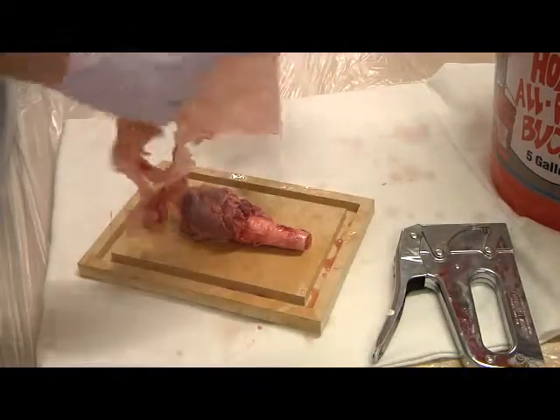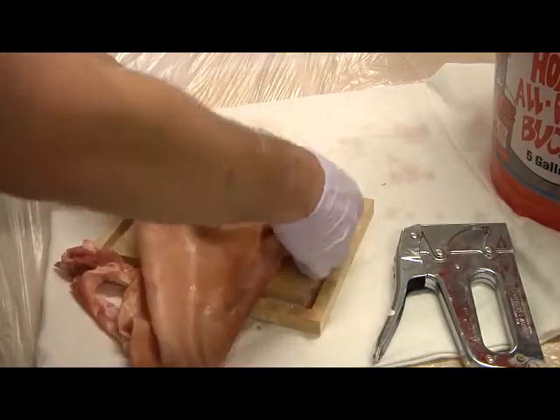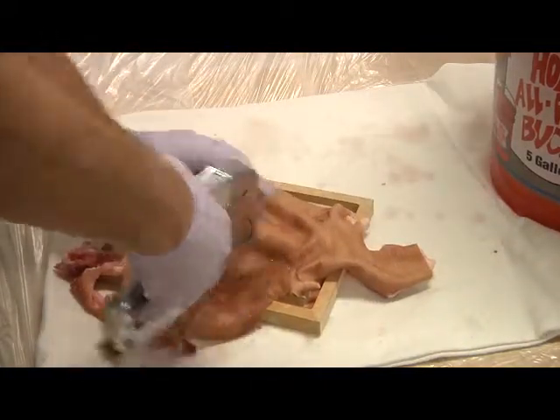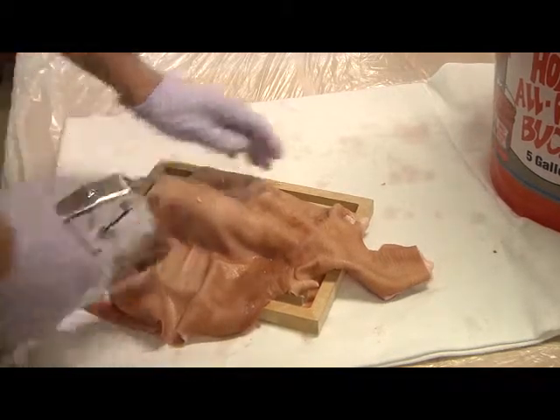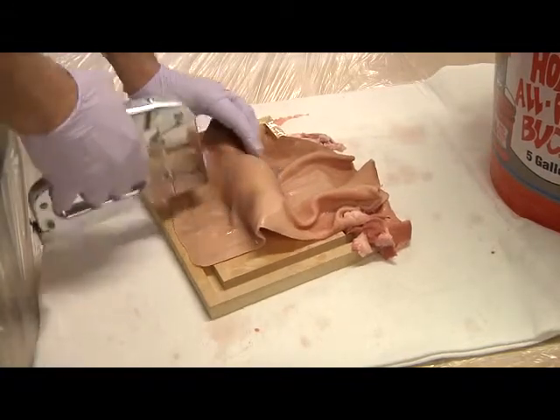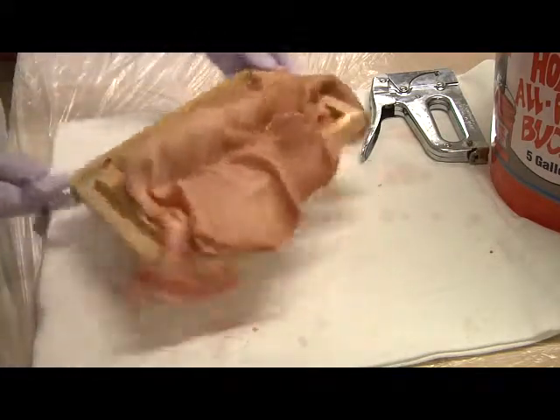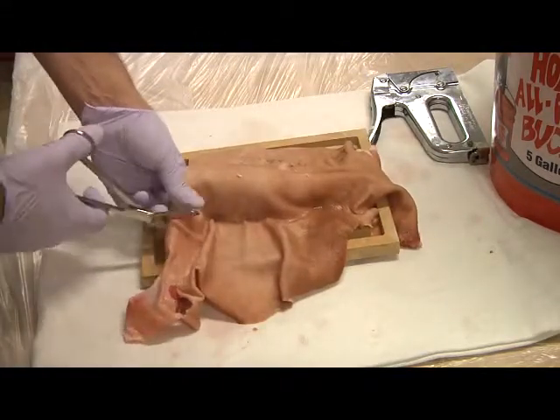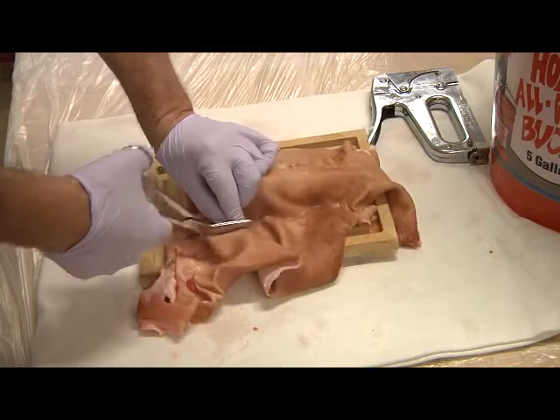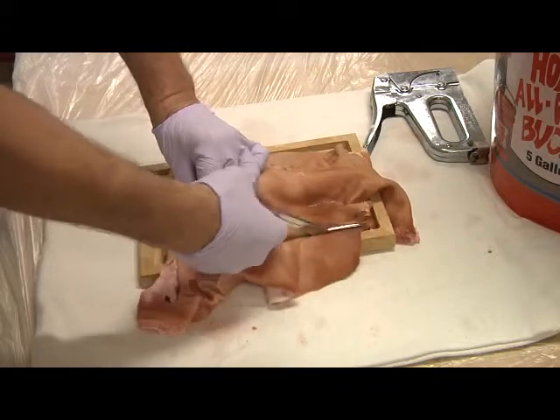I'm now going to take my skin, place it over the specimen, and also staple it tight against the specimen. Either before or after you staple down the skin, it may be good to trim it to make the specimen a little bit neater for your student. And also, at times, the slaughterhouse will not send you enough skin, and you may want to reuse some of the skin.